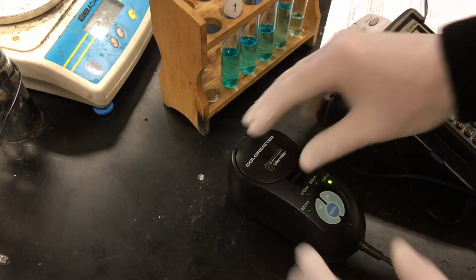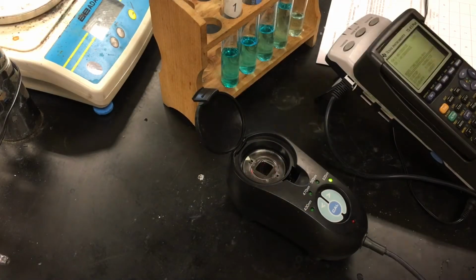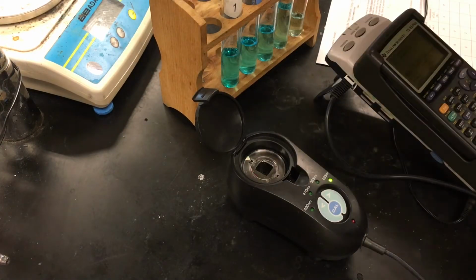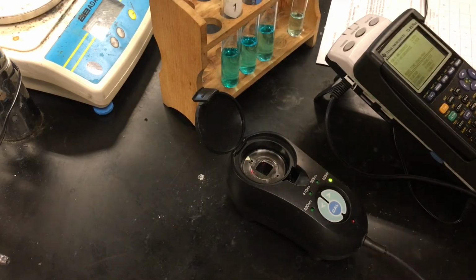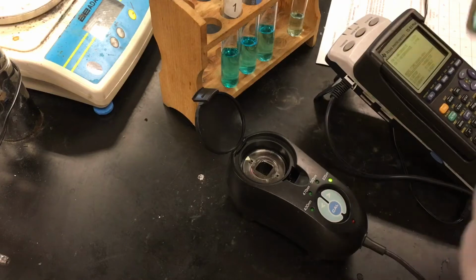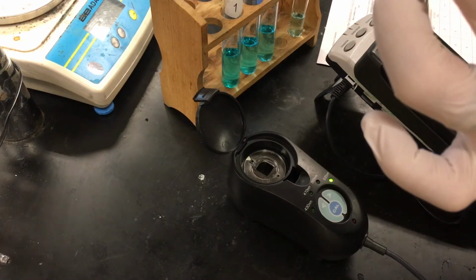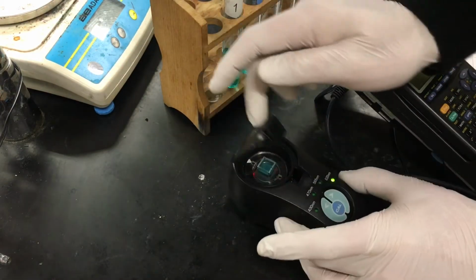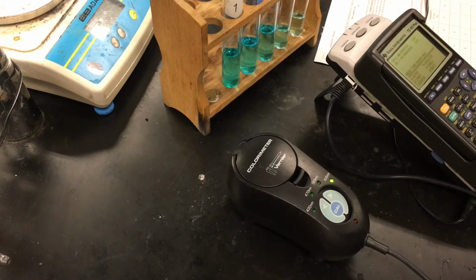And we're going to continue like this: test tube number 4, 3, 2, and then 1. Always giving the cuvette a rinse with that solution first, then filling the cuvette, now with solution from test tube number 4, and reading a value for this, 0.168.